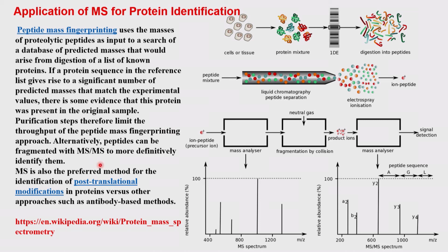You can also find a lot of proteins go through post-translational modification. Most often these are the glyco moieties, because these glyco moieties have cell surface properties to attract something, or not to attract something. Therefore, that can also be identified from the mass spectrometry.